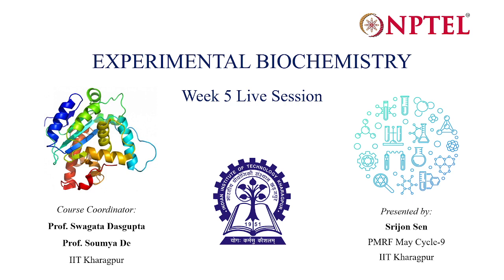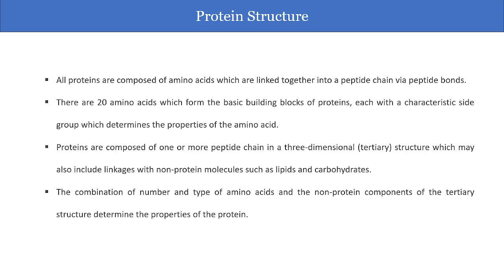Now we have proteins in hand, and we understood what protein folding and unfolding were, but how do we separate proteins? That is very important to understand. Purification of proteins from a crude extract, or from other proteins, separating proteins. This concept comes under the category of chromatographic techniques.